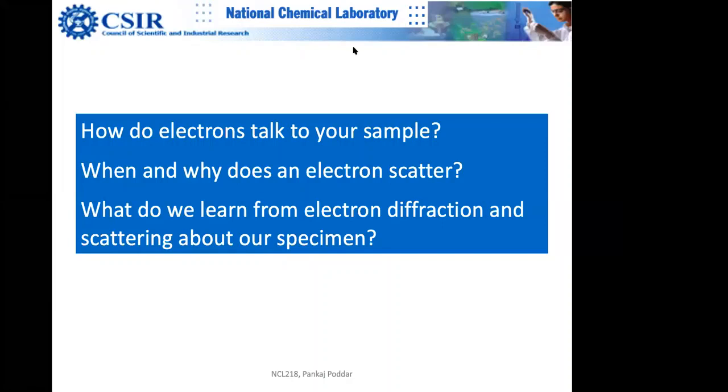And in contrast, X-rays are insensitive to the positively charged nucleus. In layman's terms, you can say that the electrons are very light, so they can sway around with high energy, and the nucleus is heavy like a fat man, and it will just sit at its place. So when you use X-rays, you really don't look at the nucleus.